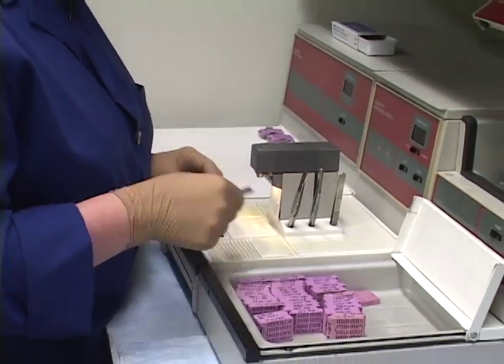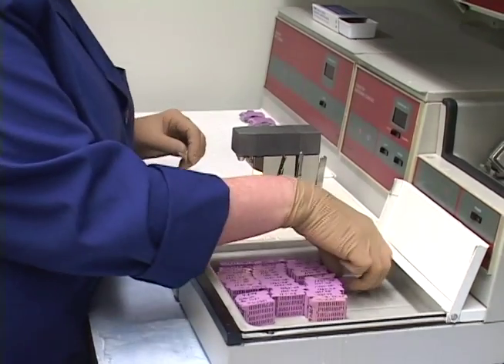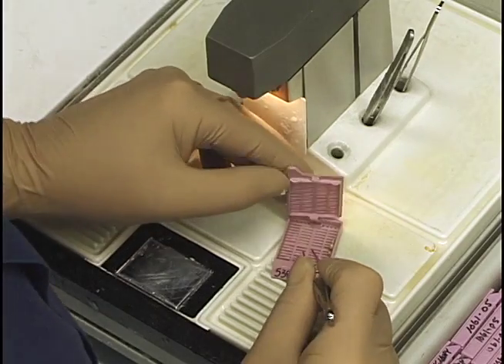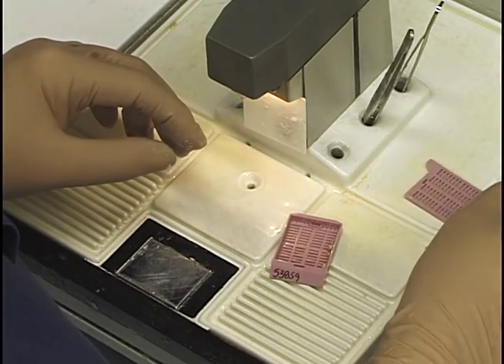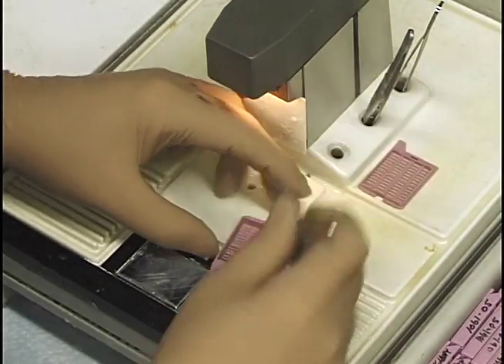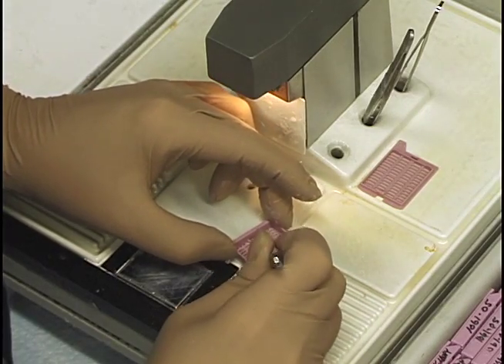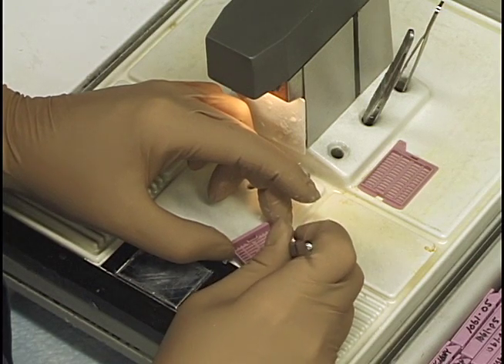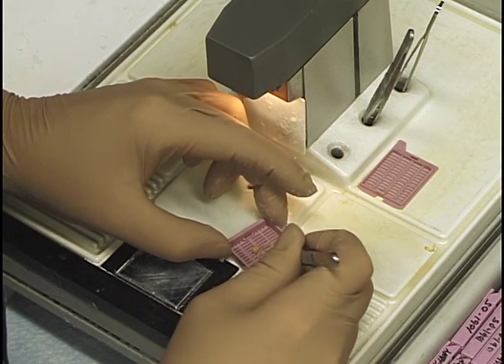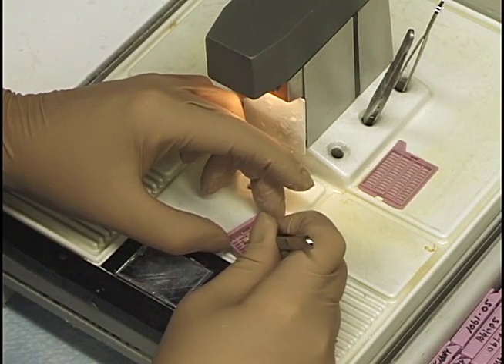Now I wanted to show a sample with epididymis. This cassette has two testes and two epididymis — that's going to be a little different. It requires orientation to get the whole long view of the epididymis. For a sample like this, I need a sagittal or longitudinal and a cross section, and I need to make sure both epididymis are facing down. It creates more of a challenge for a beginner.